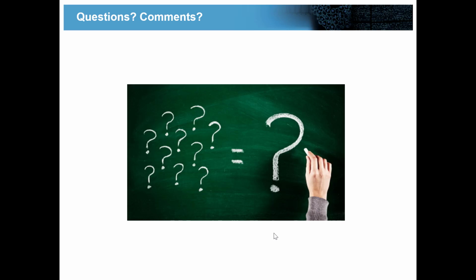And that's going to degrade the quality of that data, and actually we've now seen some evidence of this. One thing you can do to try and offset this is do a ramped collision energy, basically. And we do that. We go from sort of minus 15 volts to plus 15 volts in the hope of kind of, at some point, catching the right collision energy. But yeah, I agree, this is an issue. And it's not totally clear to me that it's one that can be solved easily.